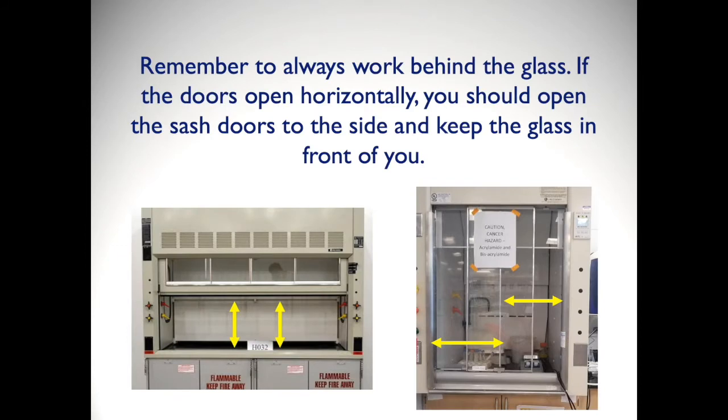Remember to always work behind the glass. If the doors open horizontally, you should open the sash doors to the side and keep the glass in front of you. The glass is the barrier that protects you.